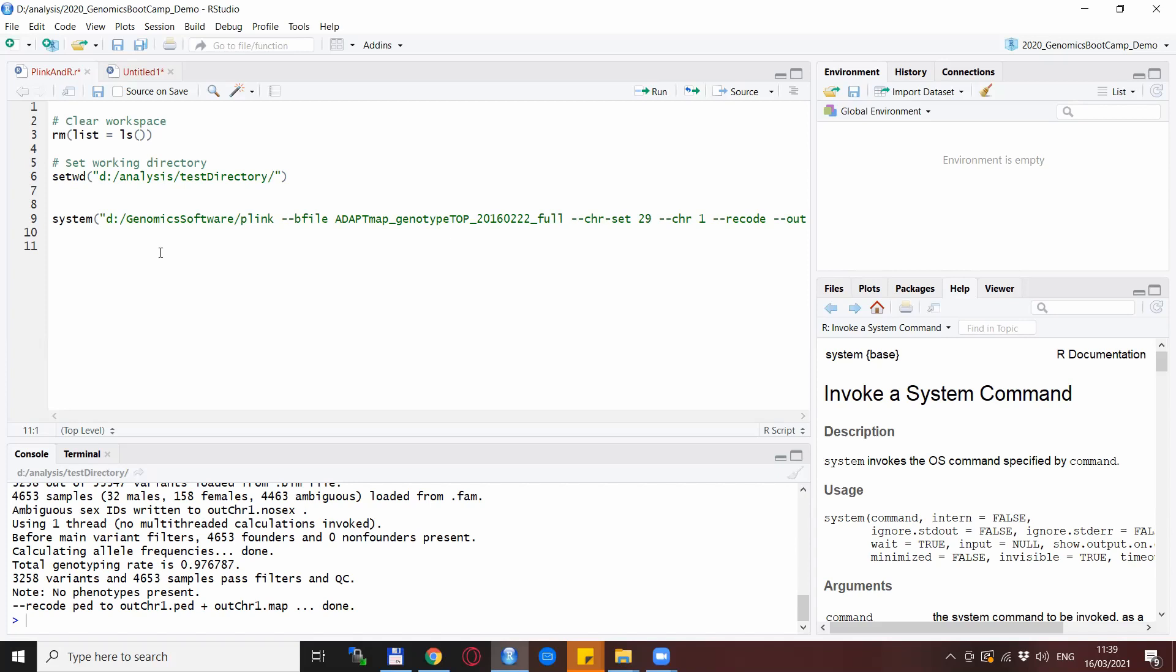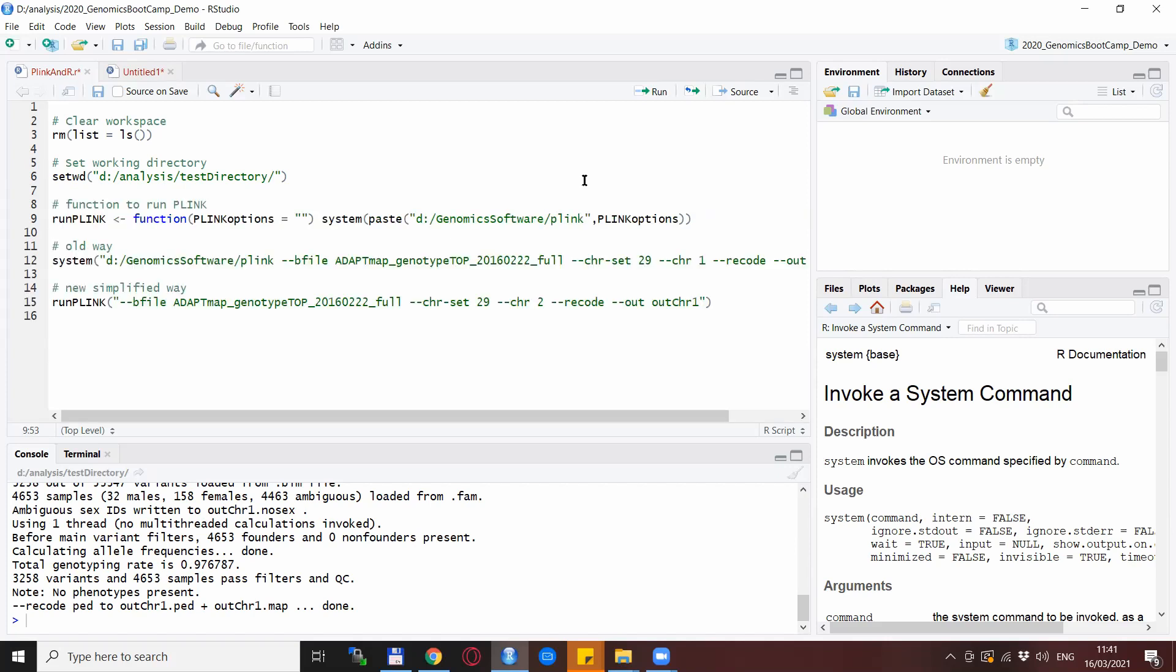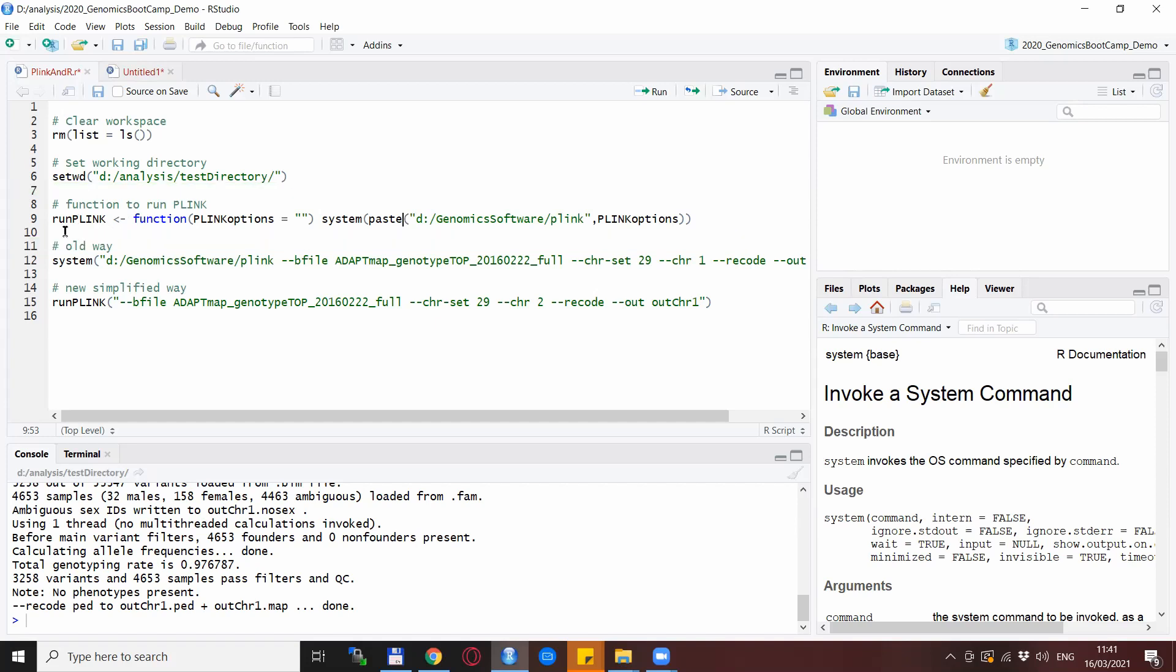But what you can do is write your own small function and I will show you how to do that. This takes care of this problem and also takes care of that problem that you basically don't need to specify the system command anymore. So we are back here with some update to the script and the crucial line is line number nine here with the function statement. This is basically a new function that will run Plink from the desired directory.